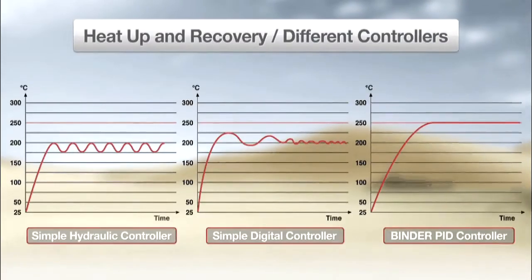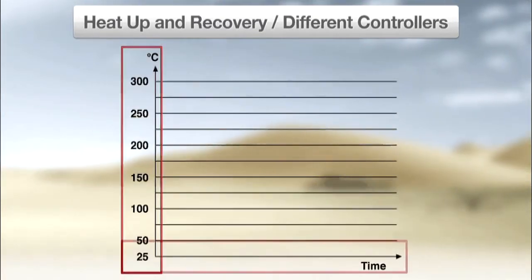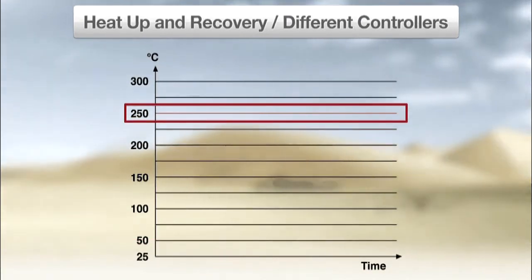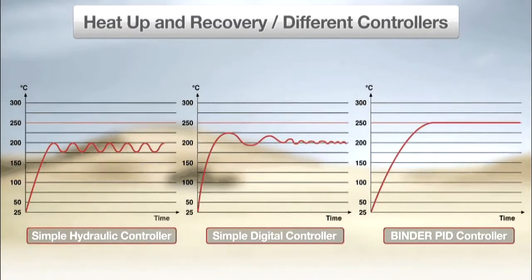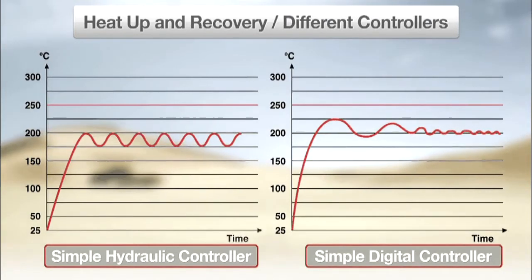Here you can see three graphs comparing heat-up and recovery of three different ovens. Temperature is shown on the Y-axis and time is shown on the X-axis. The set temperature point is 250 degrees Celsius, as indicated by the straight red horizontal line. For the ovens with simple hydraulic and digital controllers, you can see that while the time to heat up is relatively fast, neither oven accurately reaches the set temperature and the uniformity after heat-up is low.